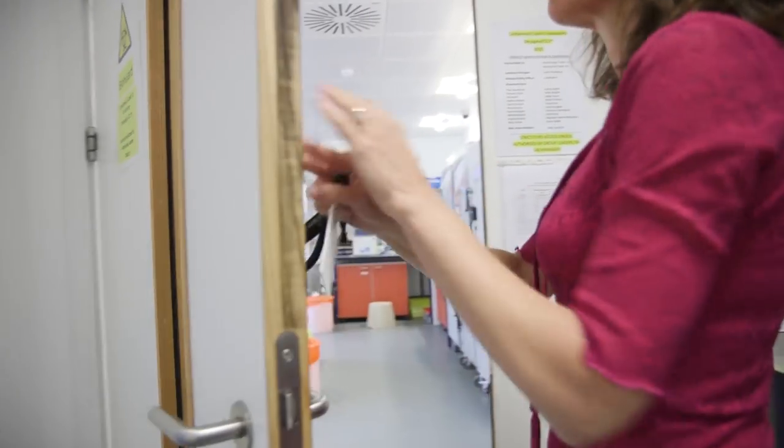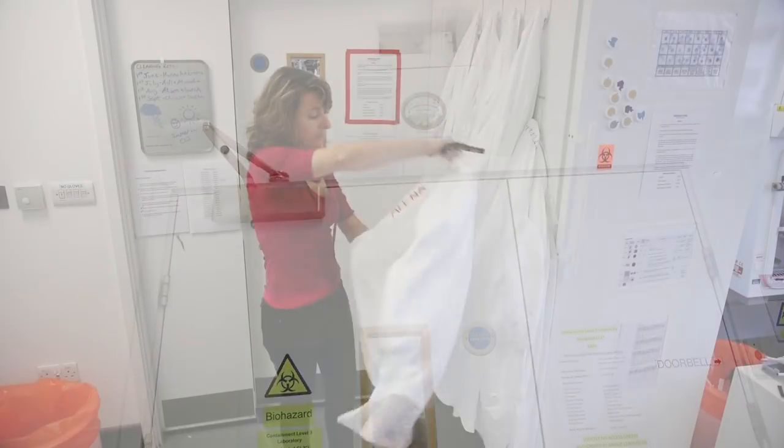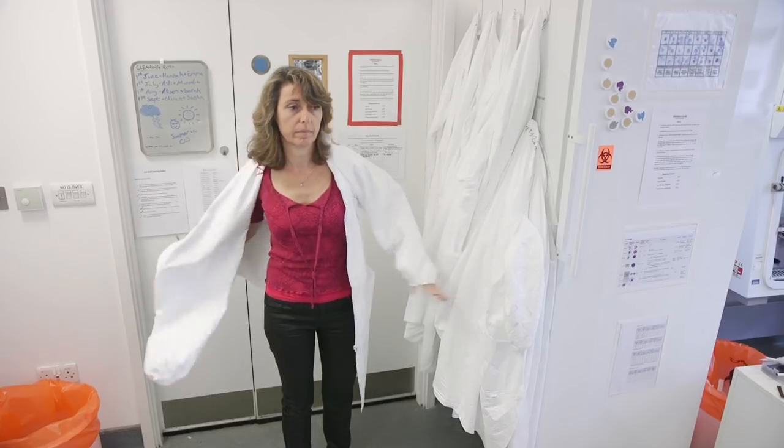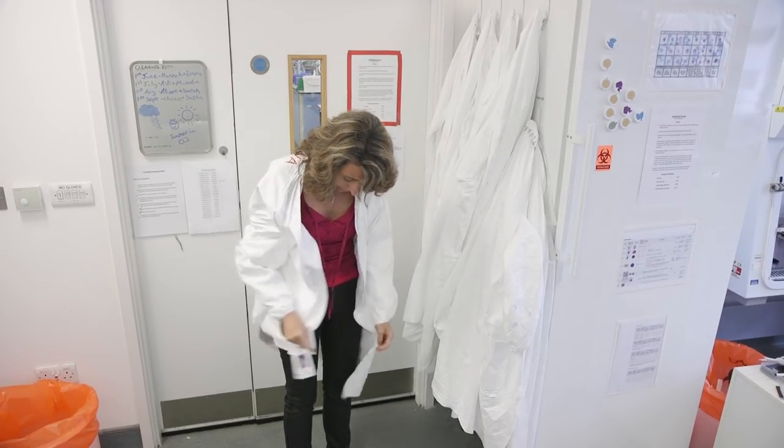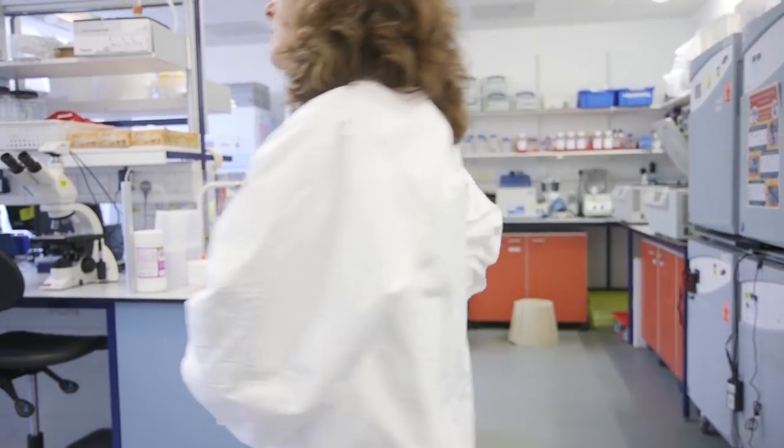The purpose of the CL3 is to protect the workers outside as well as those inside working with the infectious organism. For this, we need protective clothing in the form of a lab coat and gloves.